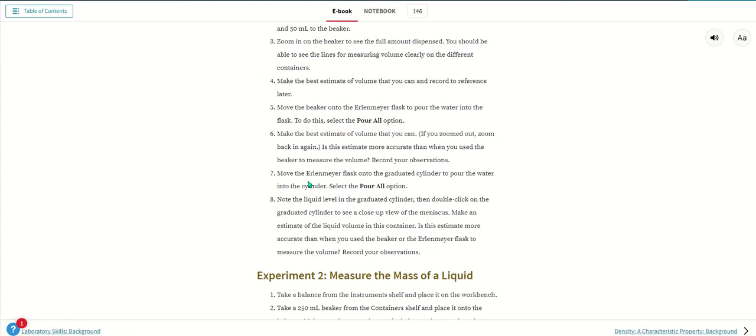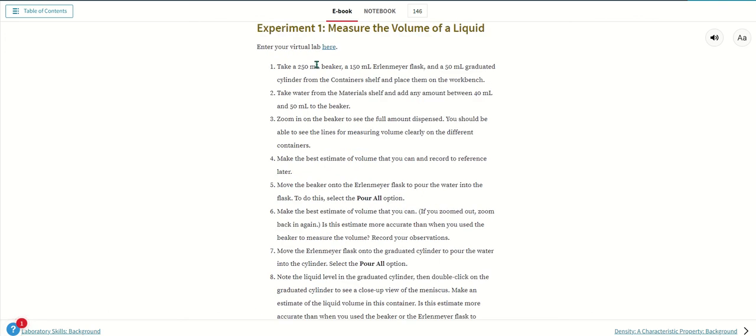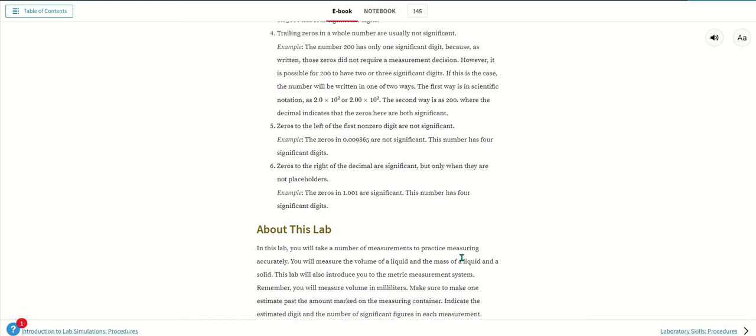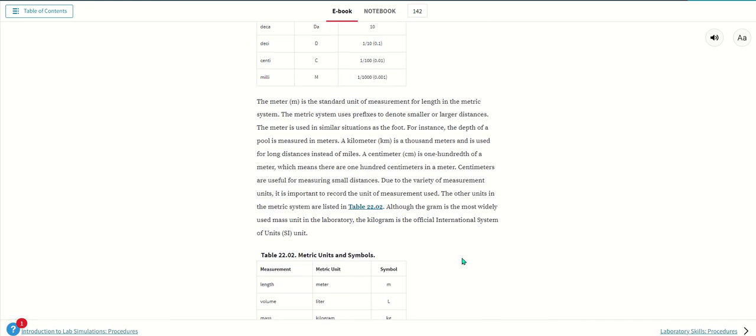Next up is your procedures. I'm not going to read step by step and put you to sleep, but I just wanted to give you an overview. First, measure the volume of a liquid. This was actually in your background, so let me head back there for just a second.